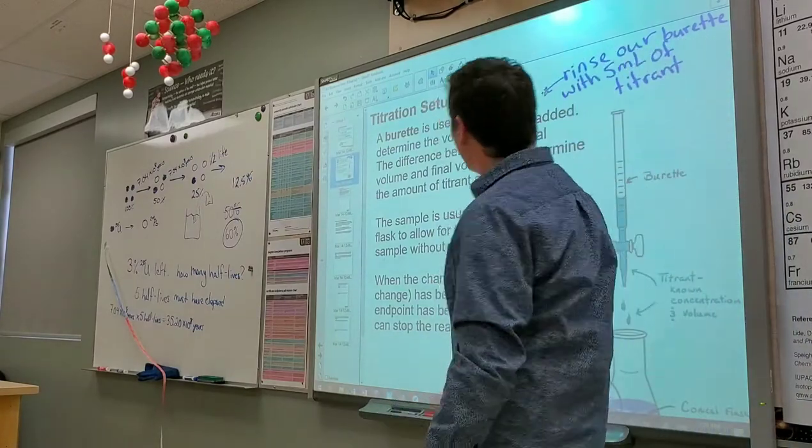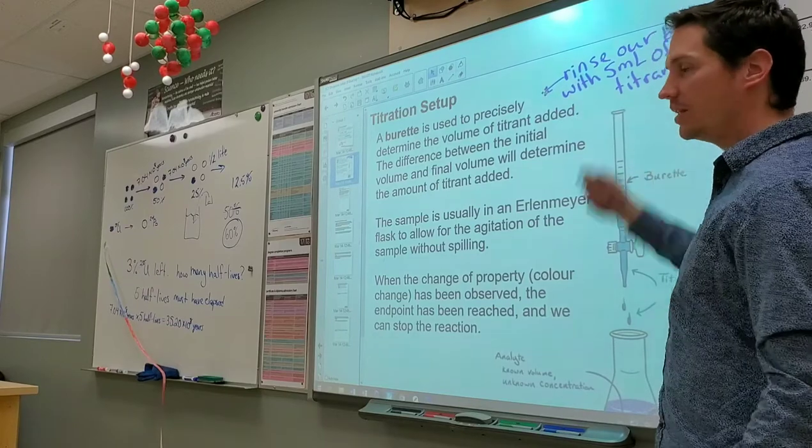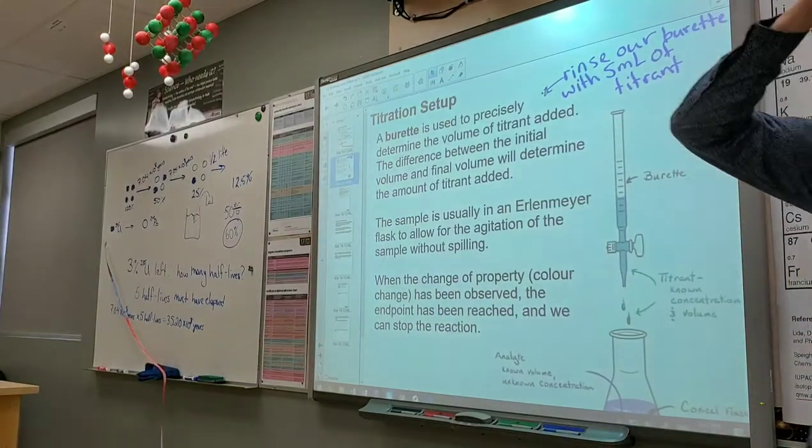Okay, the difference between the initial and final volume will determine the amount of titrant that you added. So you just have to do a little bit of math. The sample is usually in an Erlenmeyer flask. Why is it in an Erlenmeyer flask?